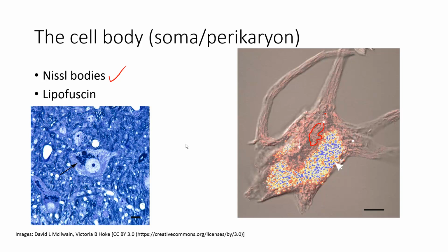So if we were staining in, say, the transmitted light microscope, not doing confocal, and we used a basophilic dye like, say, cresyl violet or something like that, these would be very dark blue staining because they're very basophilic because of all of that nascent protein being made.